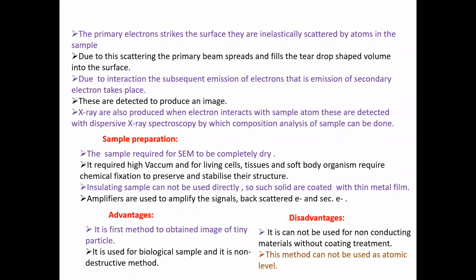So this happens in the sample material, and due to this interaction the subsequent emission of electrons, that is the emission of secondary electrons, takes place.